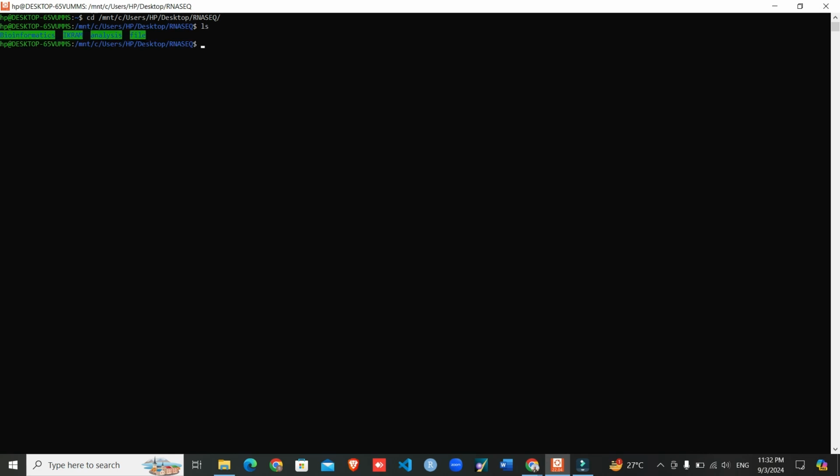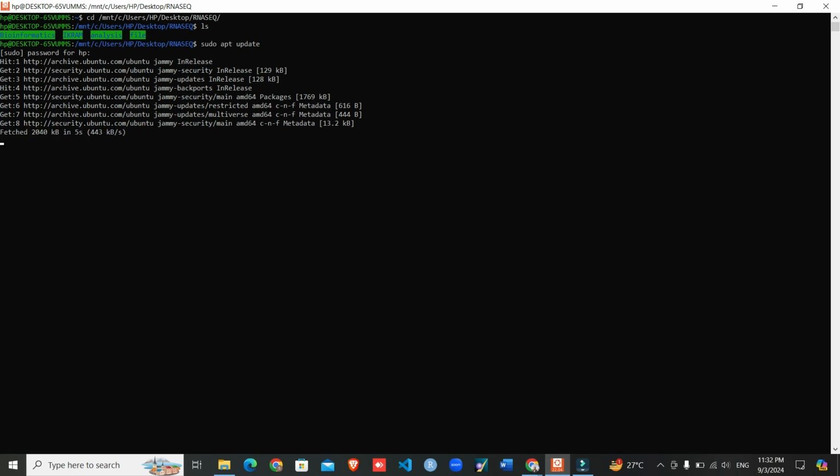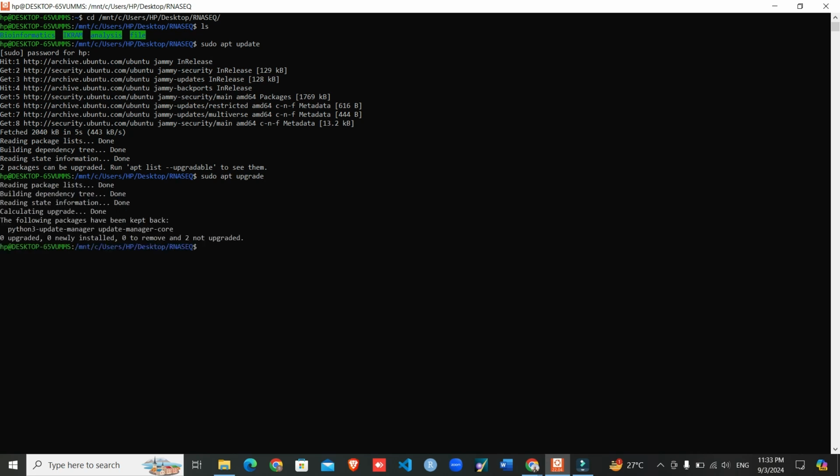Okay, before installation, we must update our system by the command sudo apt update. I will enter my password. After completing, if there is any upgrade, we will do the upgrade. Two packages need to be upgraded. So for this, sudo apt upgrade. 0 upgraded. Okay, so now we can install sra-toolkit.